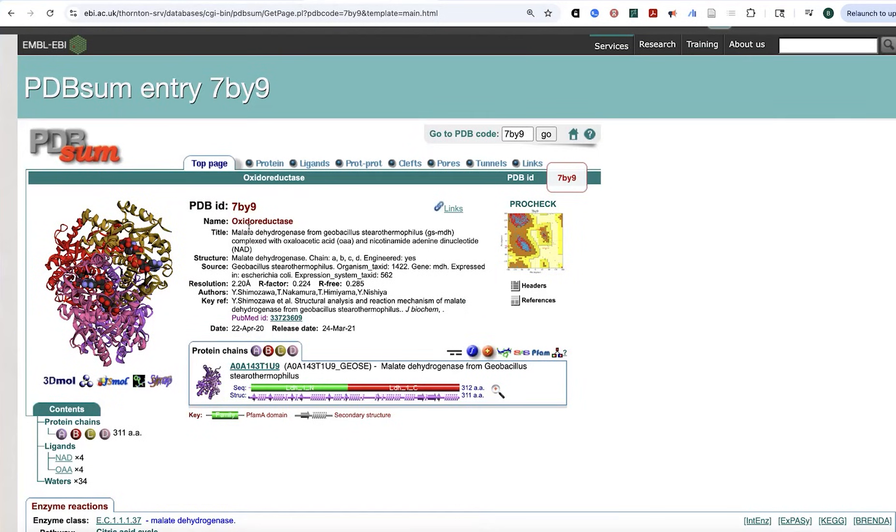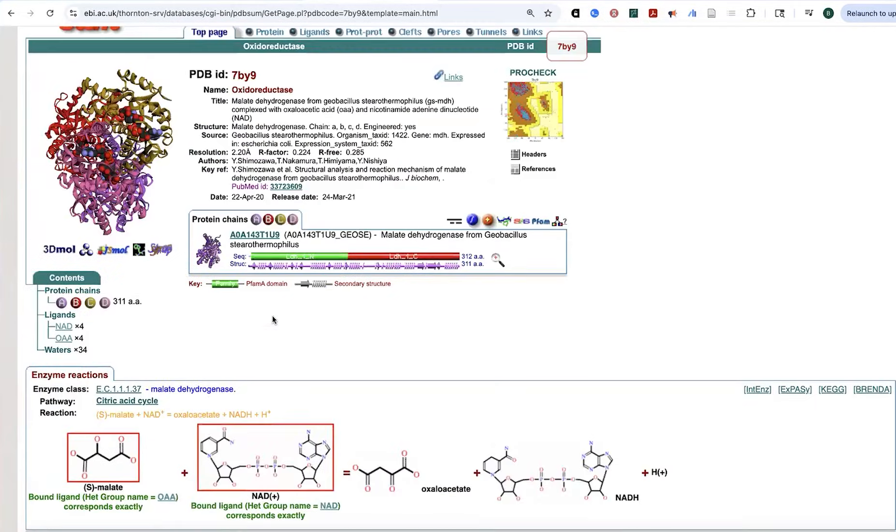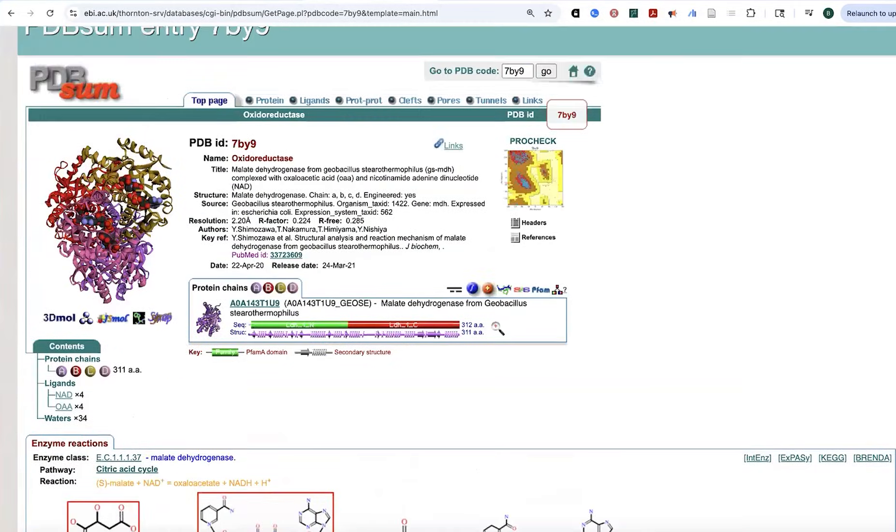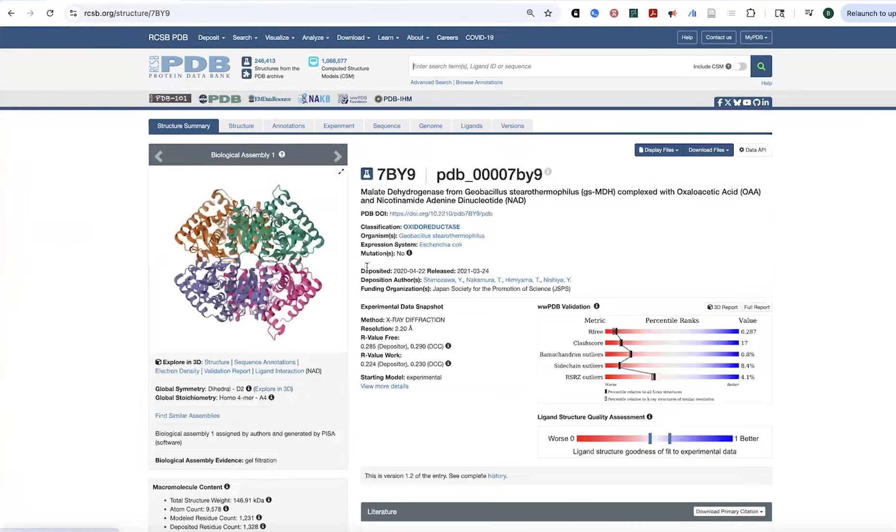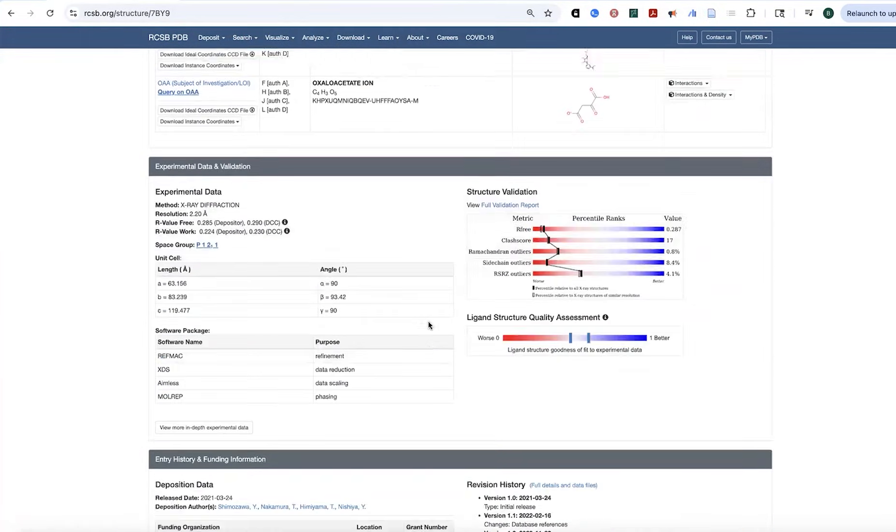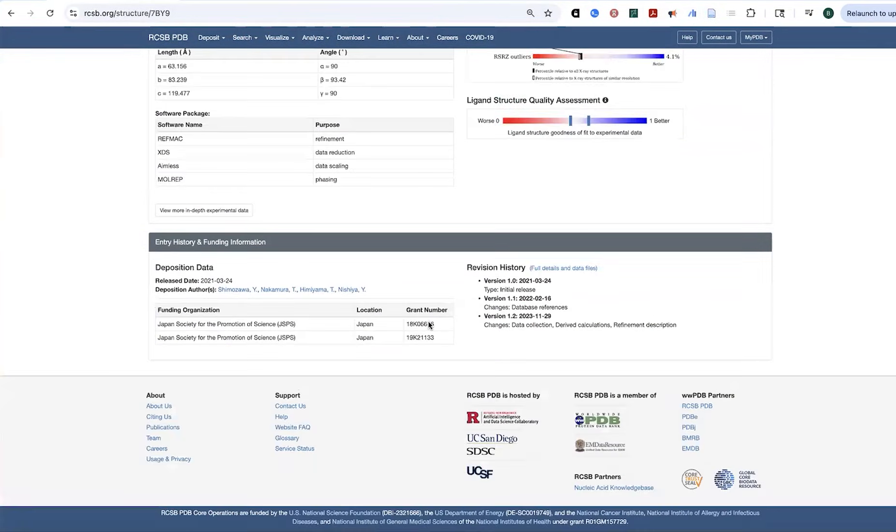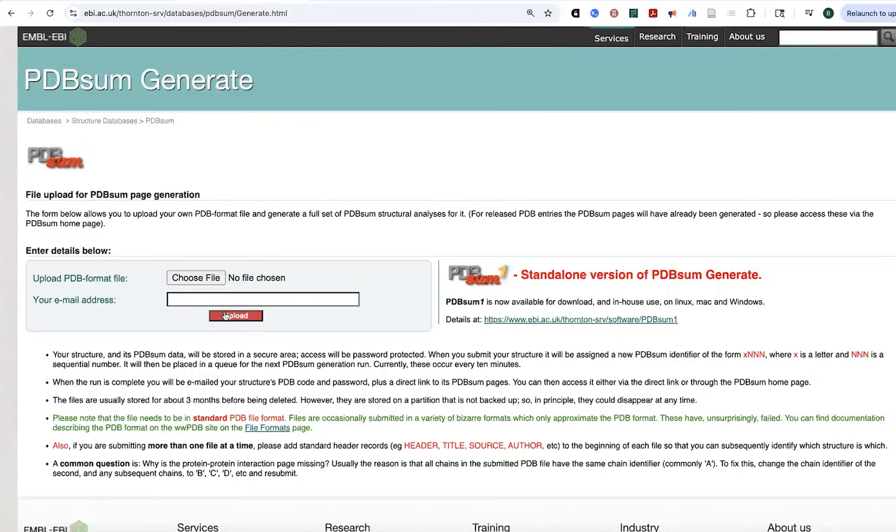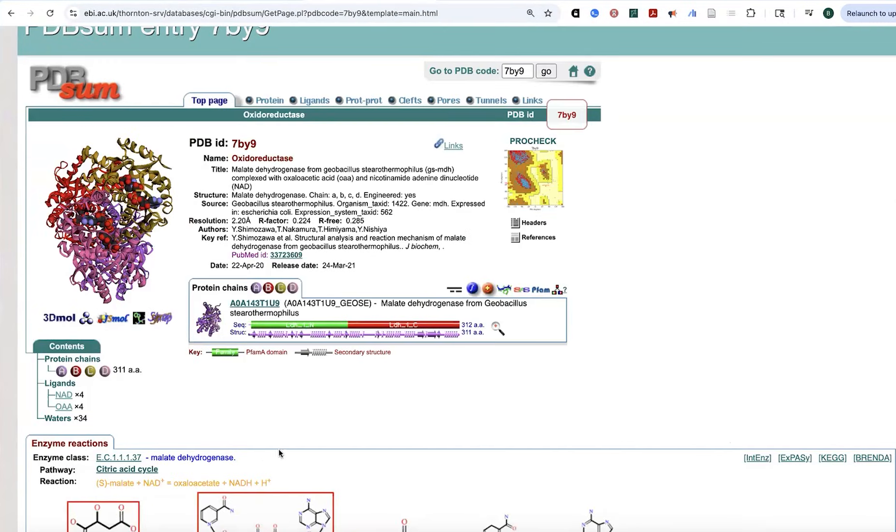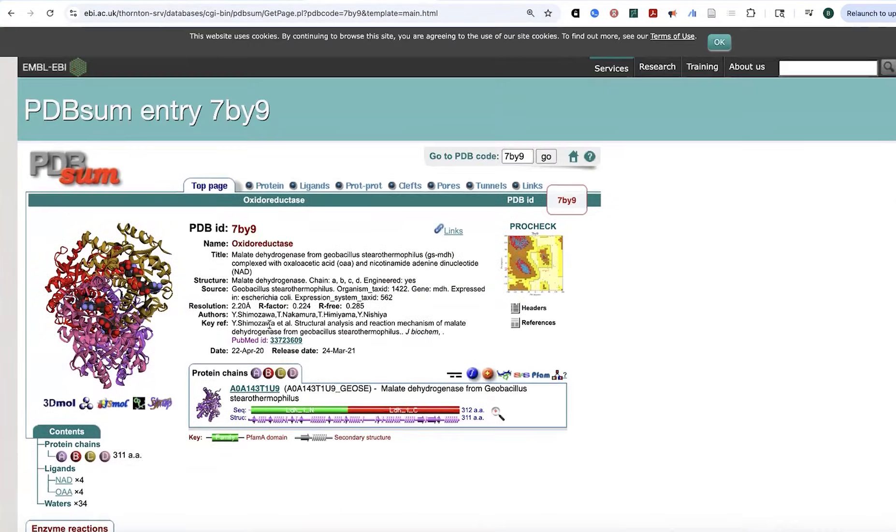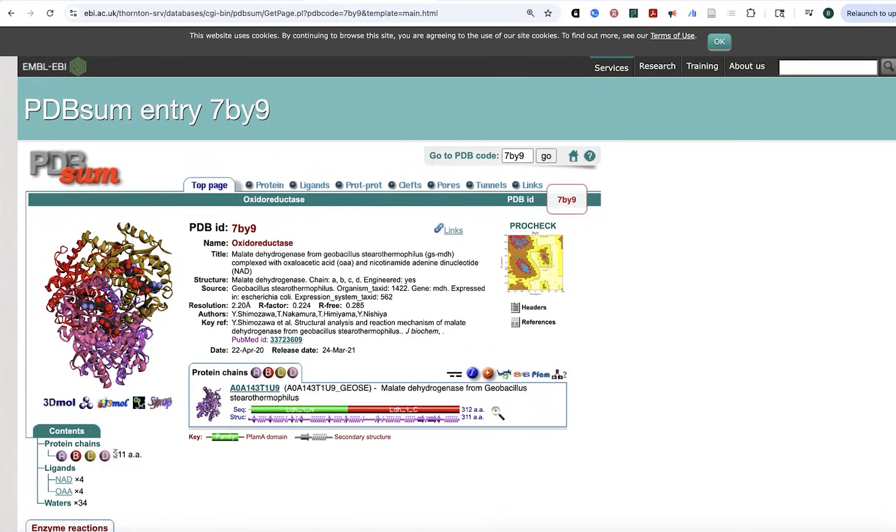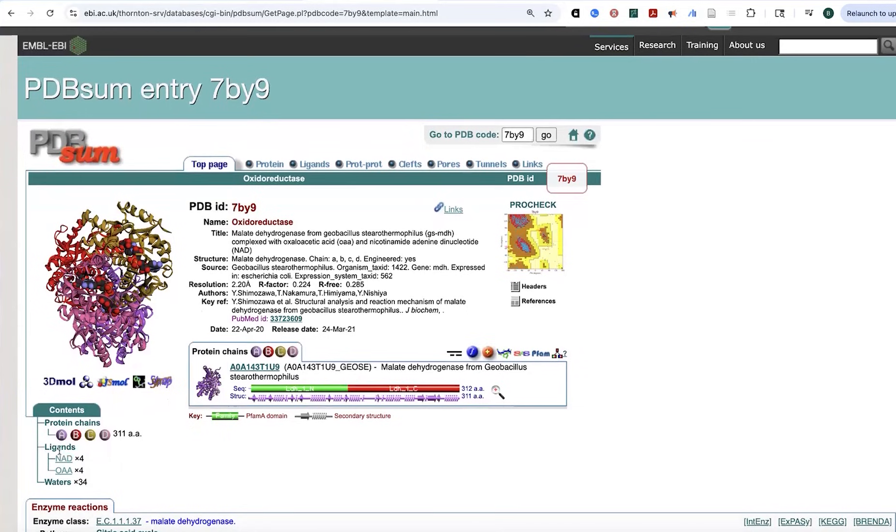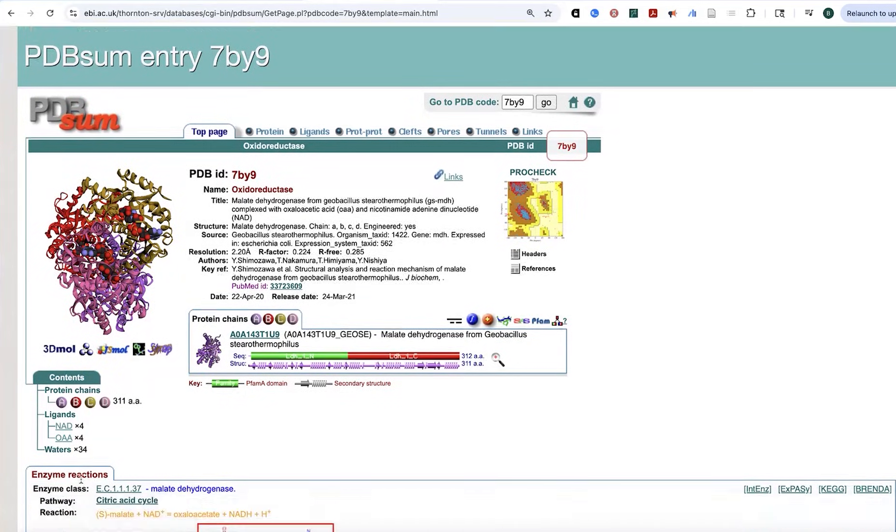Because this has been an experimentally solved structure, it's going to draw in all the annotations that were accompanying that, similarly to how you see those sorts of things, that information about publications, the reaction that it catalyzes, those sorts of things. We can also see what it contains. So we have these four protein chains, each of which is 311 amino acids.